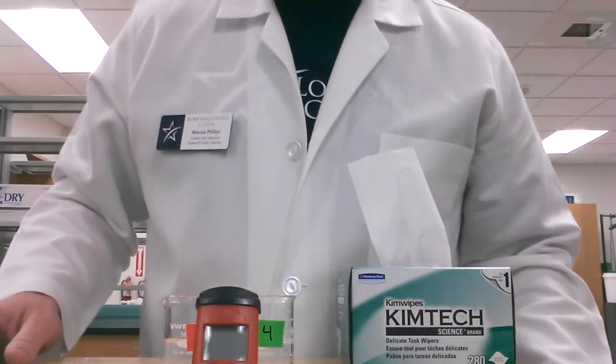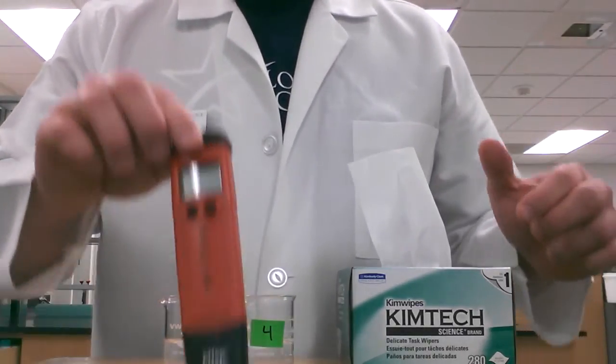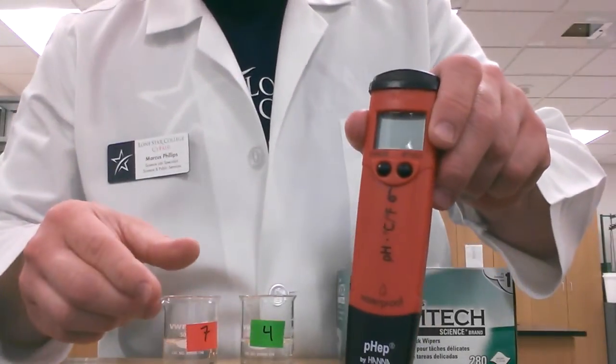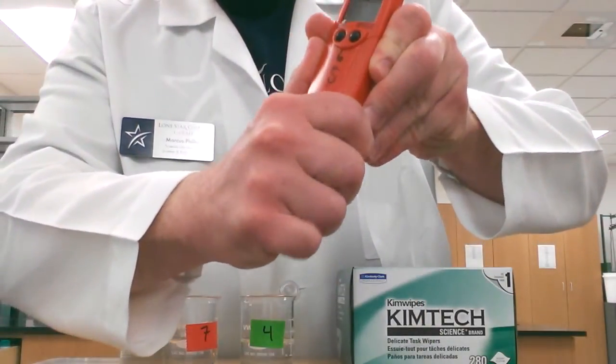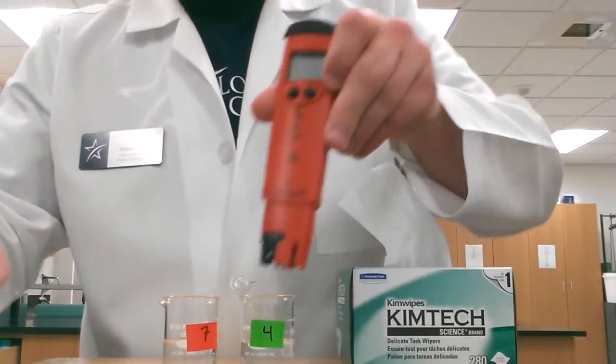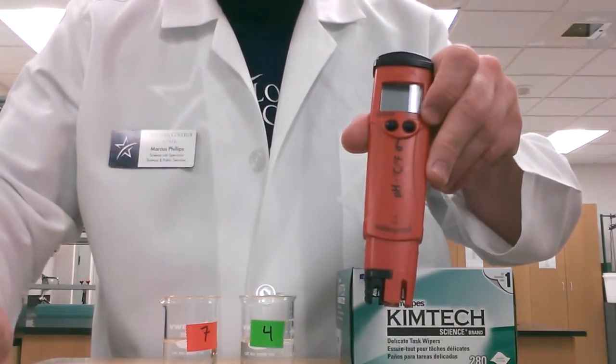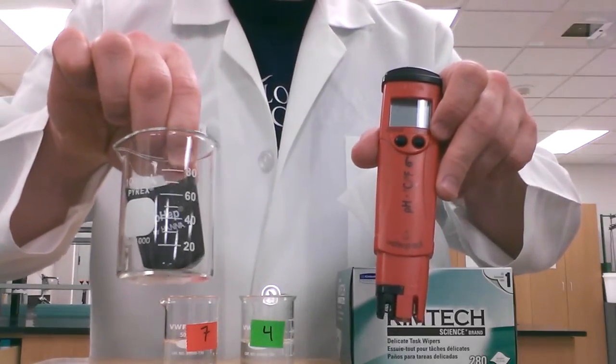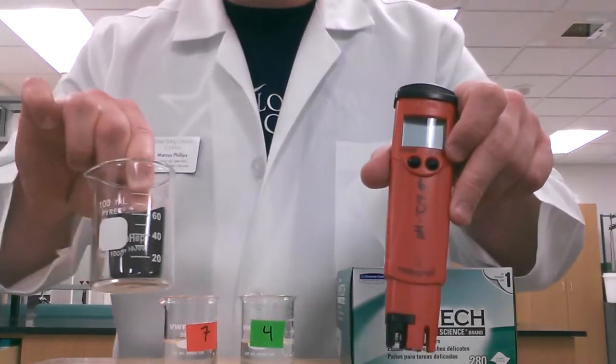So, let's get started. First, we're going to remove the cap from the pH meter, and we're going to set that cap inside of our 100 ml beaker so we don't lose that or spill the solution that's inside.